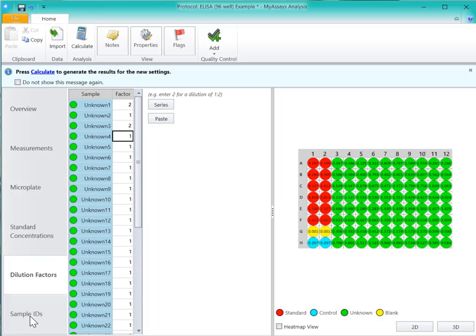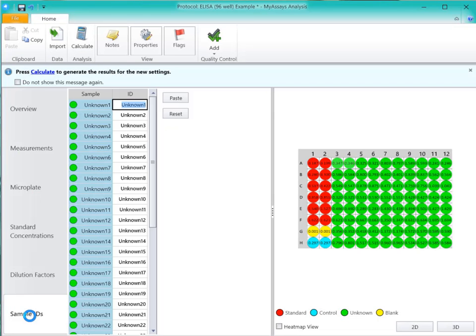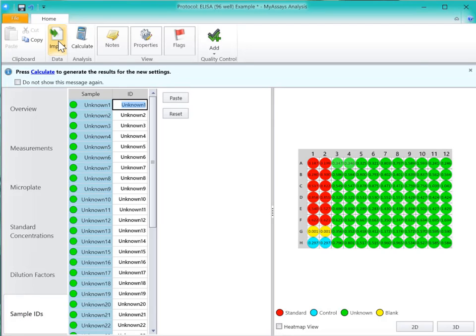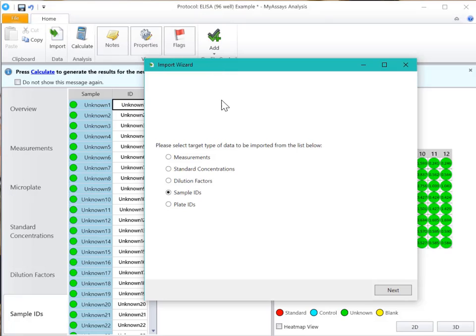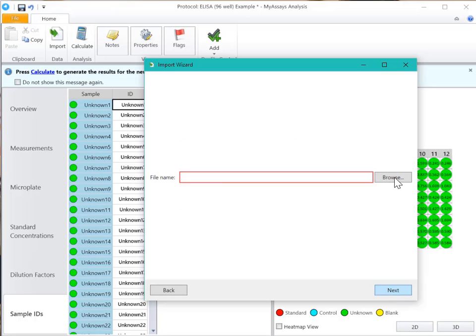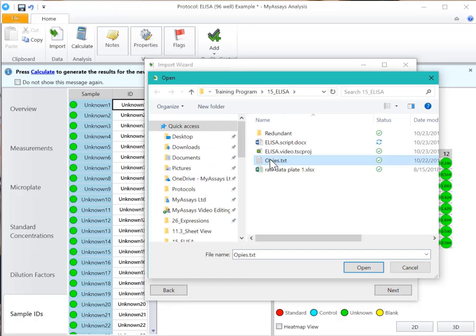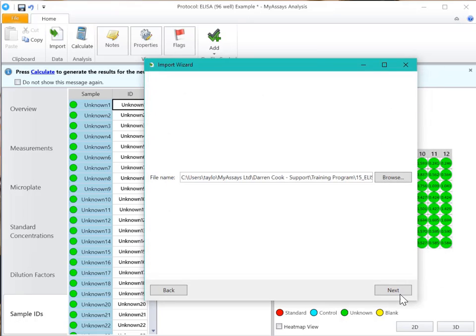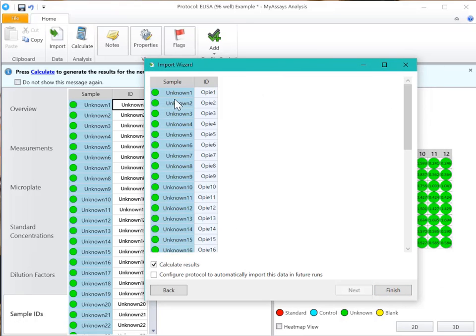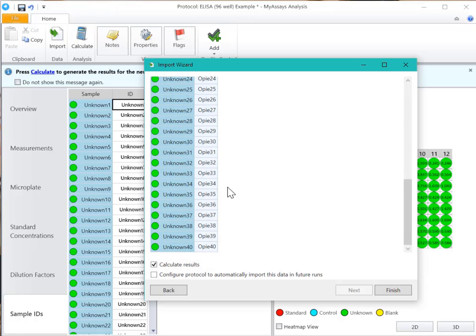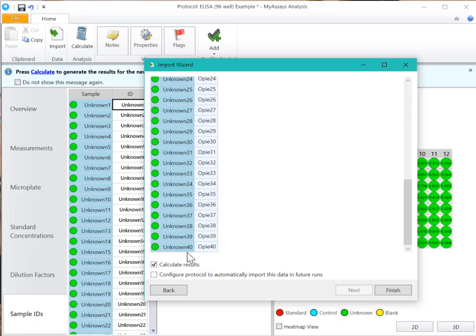Finally, I'll import my sample IDs. Again, I could choose to copy and paste or use the Import Wizard to import my sample IDs file. I'll choose Sample IDs. Browse for my text file containing the sample IDs. Now you can see my sample IDs are ready to be imported, and if we leave this box checked, when we click Finish, the results will be calculated.